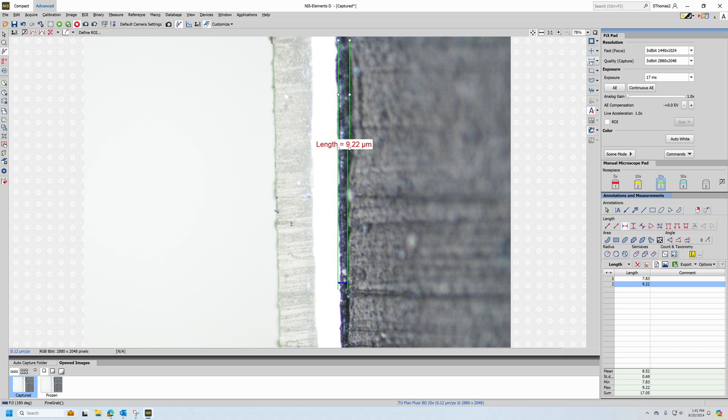If I want to put a scale bar on the image, which I would highly recommend, particularly if the image is going to be distributed or sent to people, that button is here. This button is the little micron bar, you left click, and then the button appears down here at the bottom.